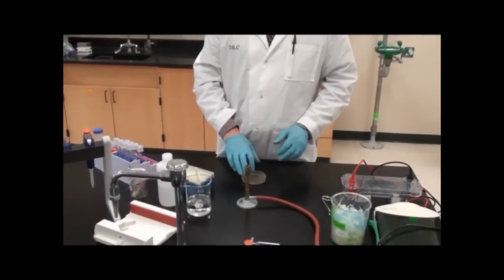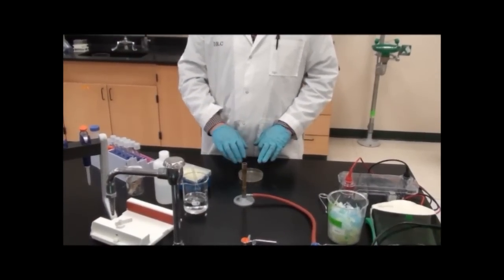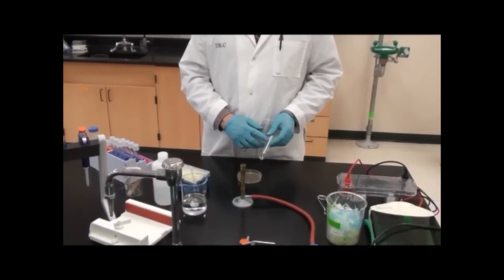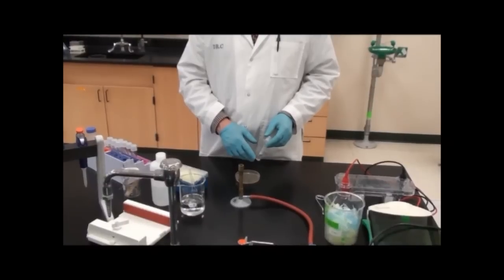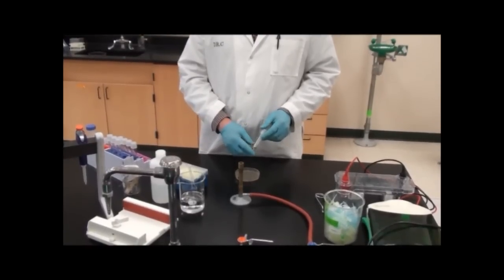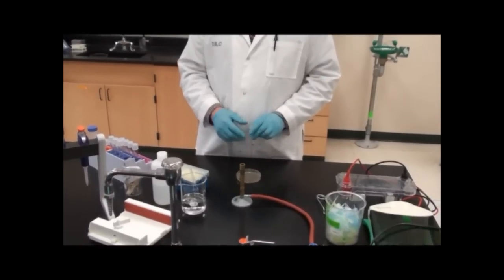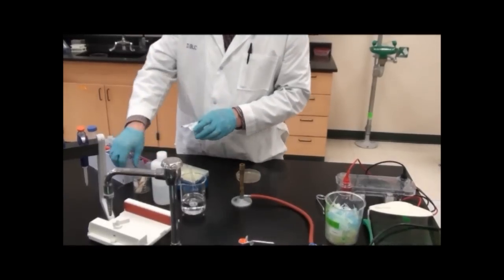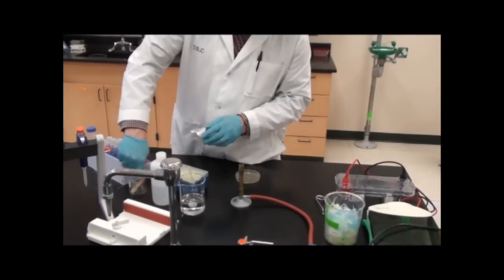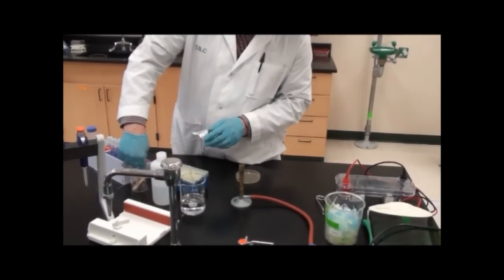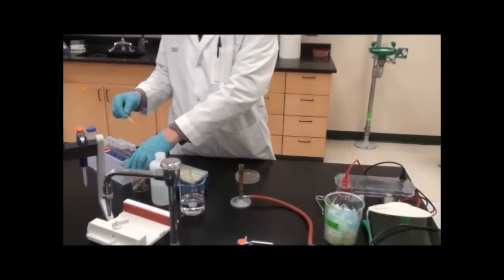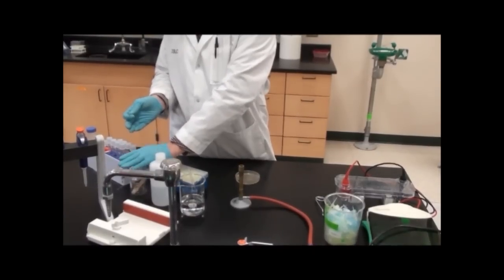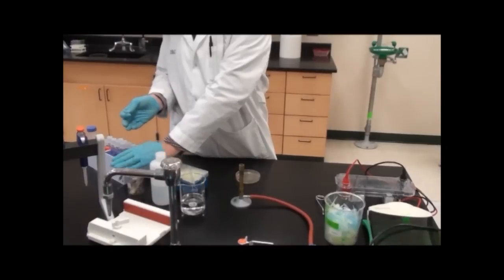Now we're going to select one of these colonies and grow that colony up in these tubes, which contain LB growth media with ampicillin. Again, we have the same selective agent. I'm going to pull out a sterilized toothpick. I'm using gloves on this procedure to keep my hand germs off of the toothpick and colonies. I'm going to cover this back up because they're sterilized.